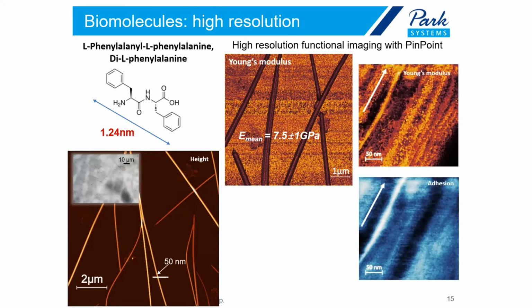You can measure their mechanical properties. You can measure things like modulus. In this instance, it's around about 8 gigapascal. And you can measure adhesion as well.